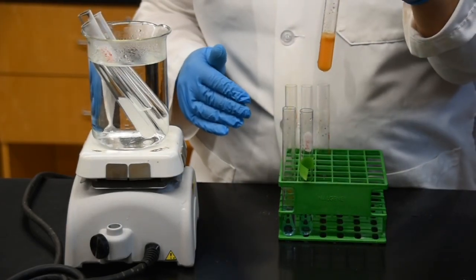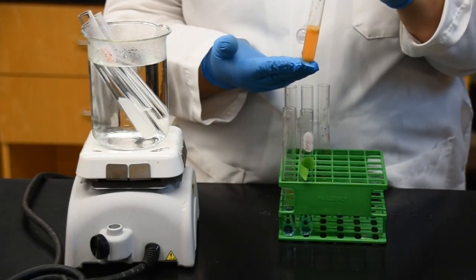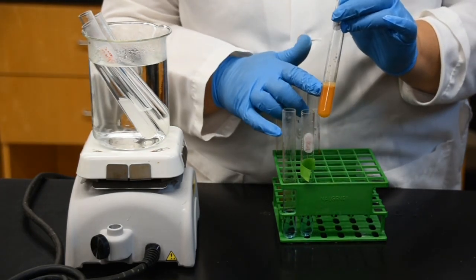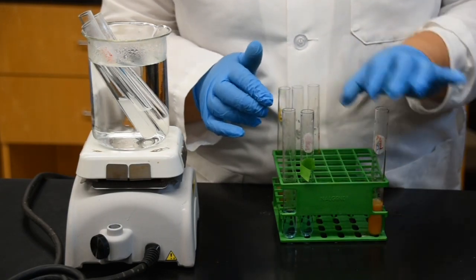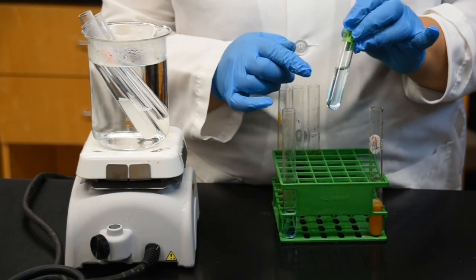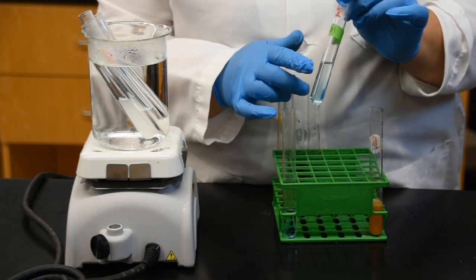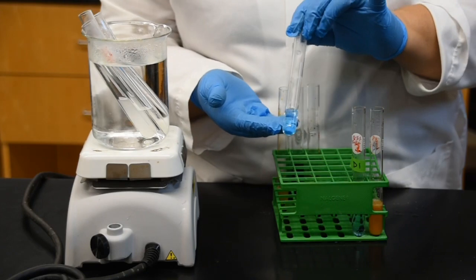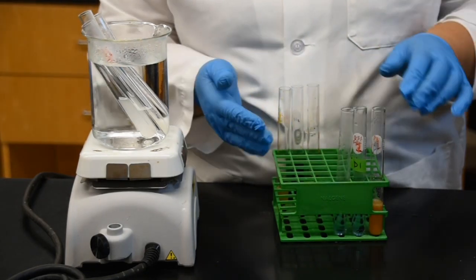So let's take a look at this. The first sample we have right here was our simple sugar sample. You can see a very beautiful orange color, which indicates that this sample is positive for simple sugar when Benedict's was added. The next sample we have is a starch. Again, we started with a bluish color when we added our indicator, and after heating you notice there is no color change. And this is our protein sample. Again, you notice that there is no color change here either.